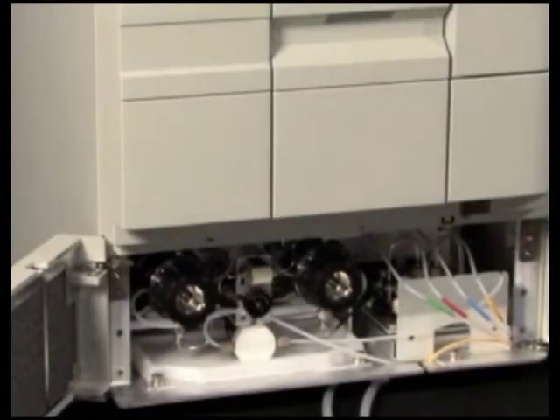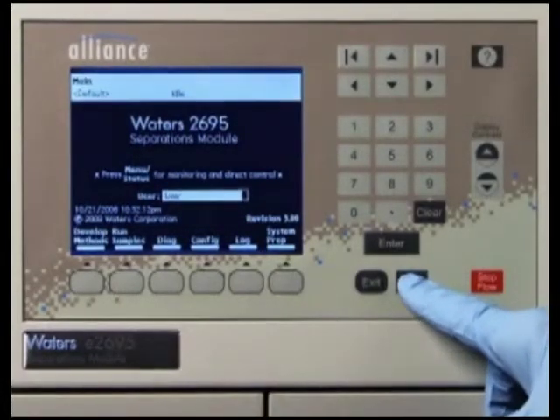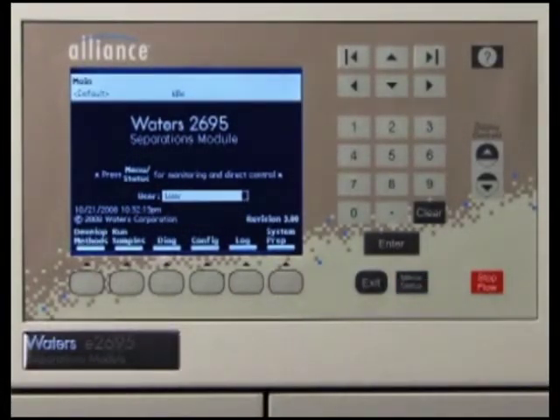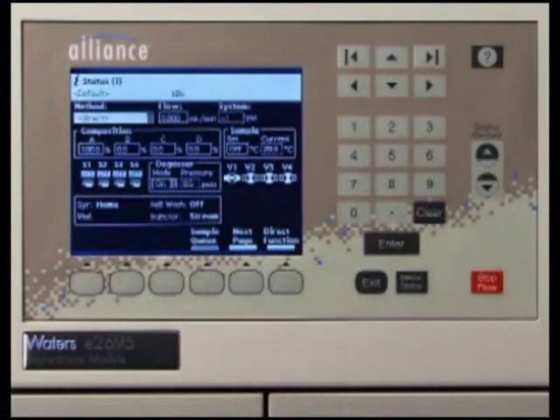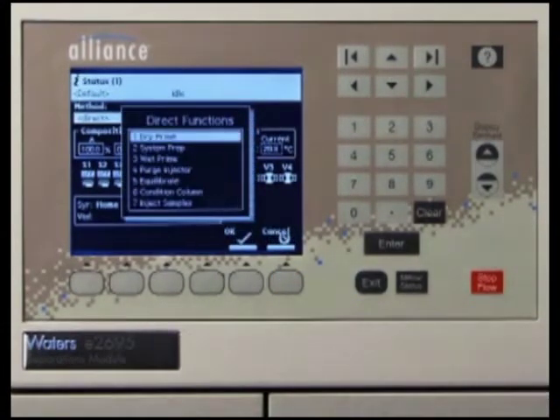To prime the solvent management system, you will need to perform a dry prime. Begin by pressing the menu status key to enter the status screen. Press the direct function screen key and the direct functions menu appears. Select Dry Prime, then press OK.